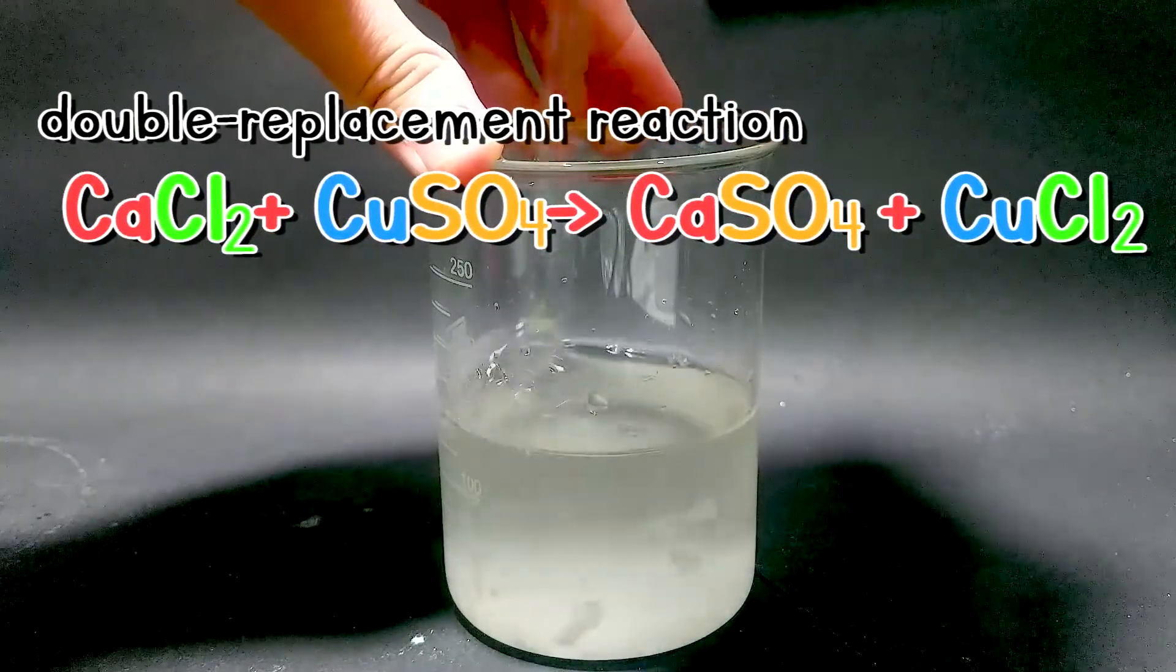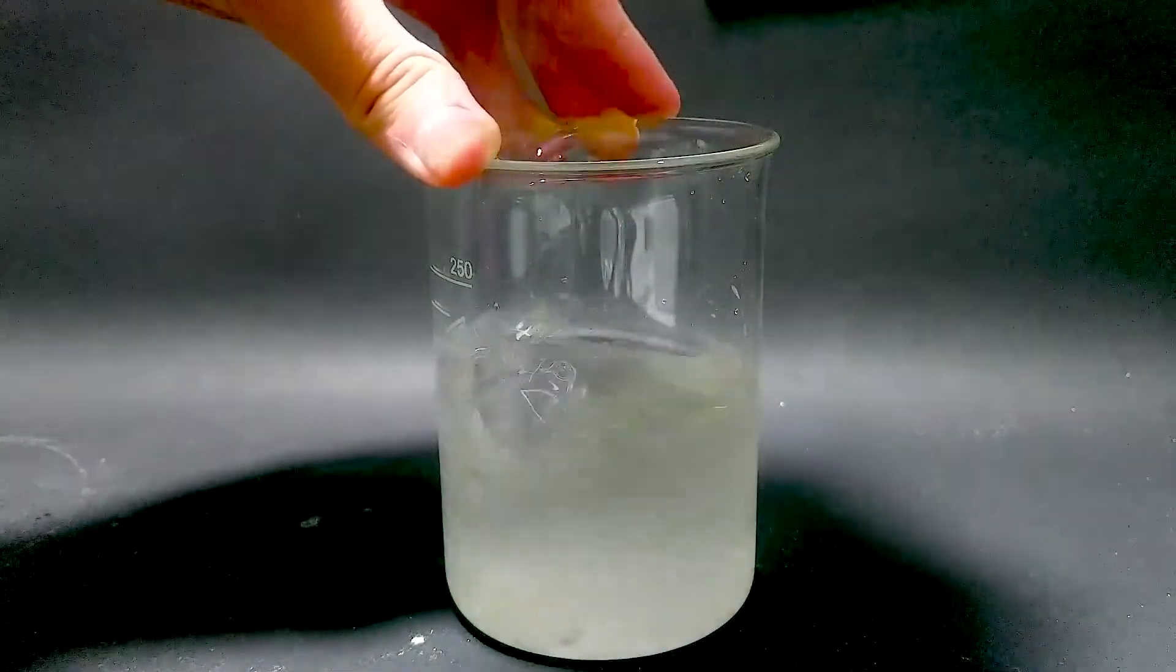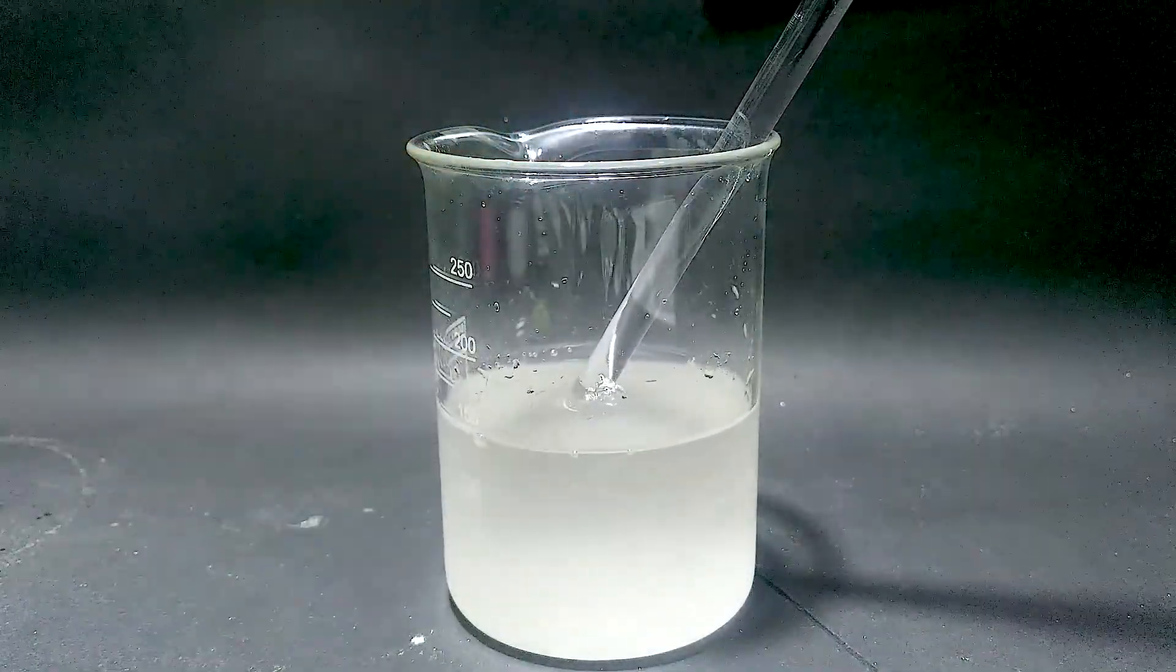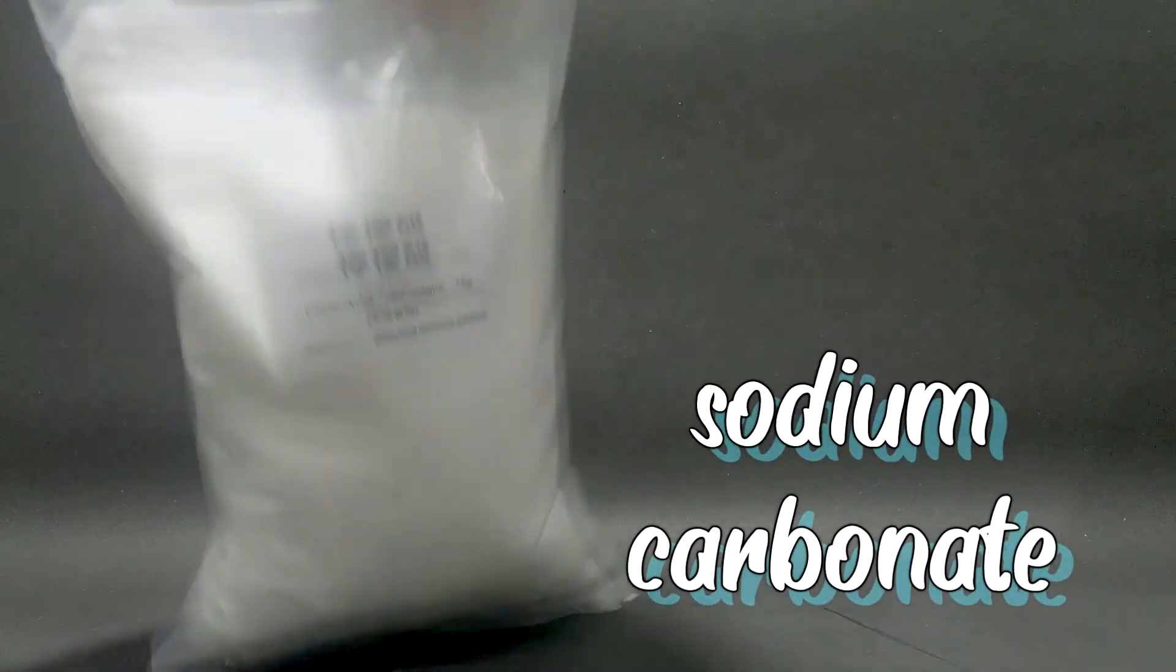Therefore, by double replacement reaction, we can synthesize them pretty easily. So let's directly jump into the reaction. To make sodium citrate, we need to prepare two ingredients: sodium carbonate and citric acid.